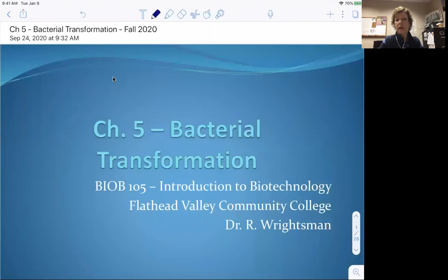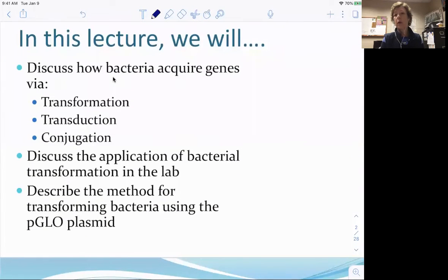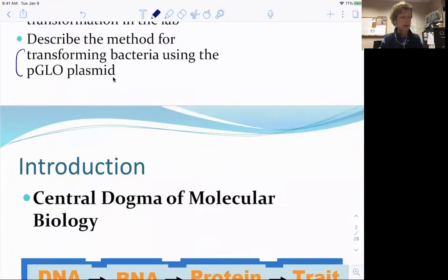In this lecture, we're going to be talking about Chapter 5, Bacterial Transformation, and we'll be talking about some things that we'll be doing in lab in the upcoming week. So what we'll talk about here is how bacteria acquire genes from outside their genome through transformation, transduction, and conjugation. And we're going to emphasize transformation because that's a procedure that we're going to perform in the lab. We're going to discuss applications of this to what we actually do to put genes into bacteria for the biotechnology industry, and go in detail in how we perform that experiment so you'll understand what goes on in that.